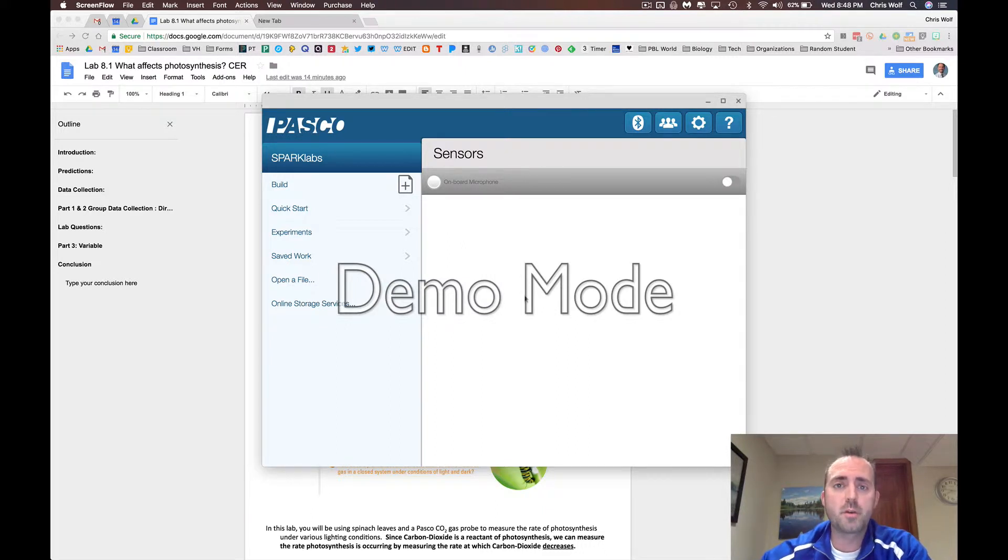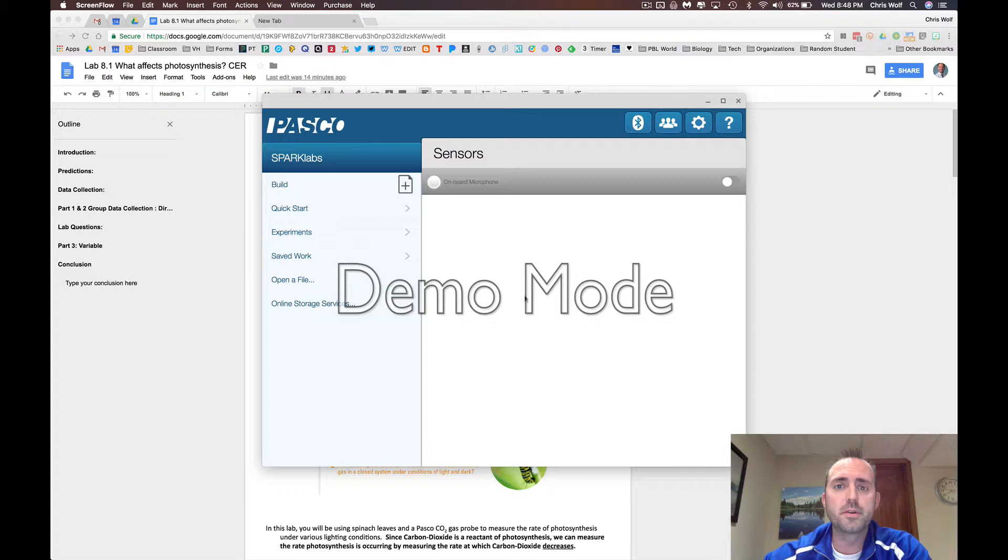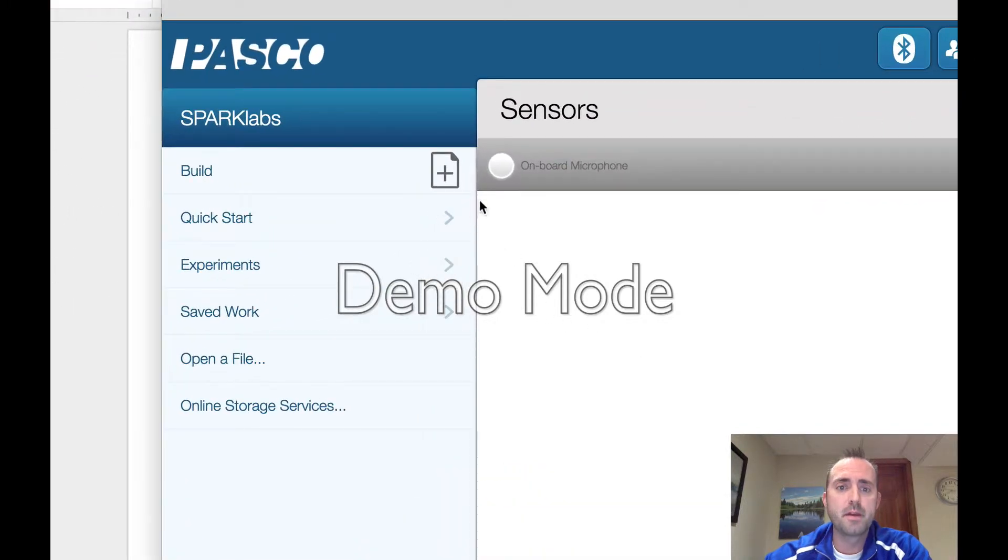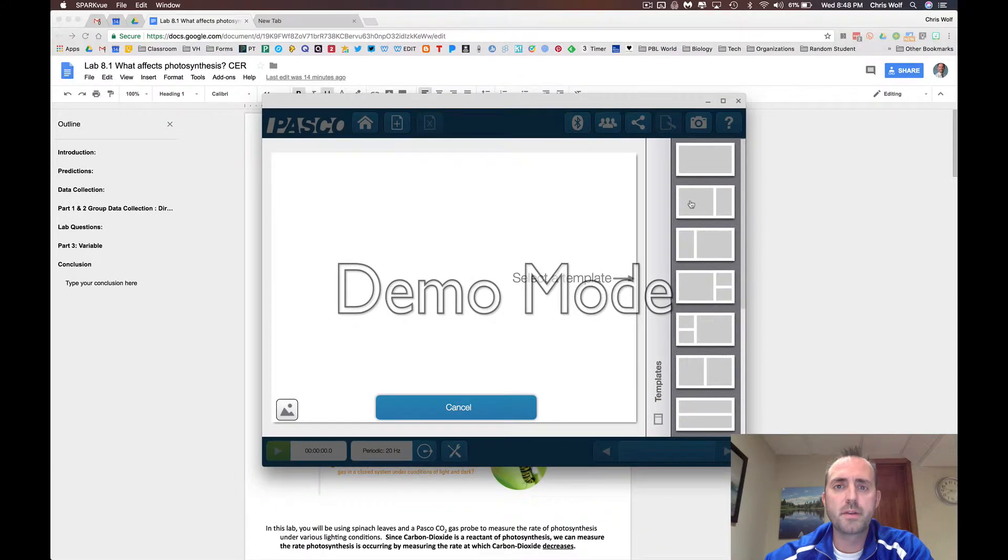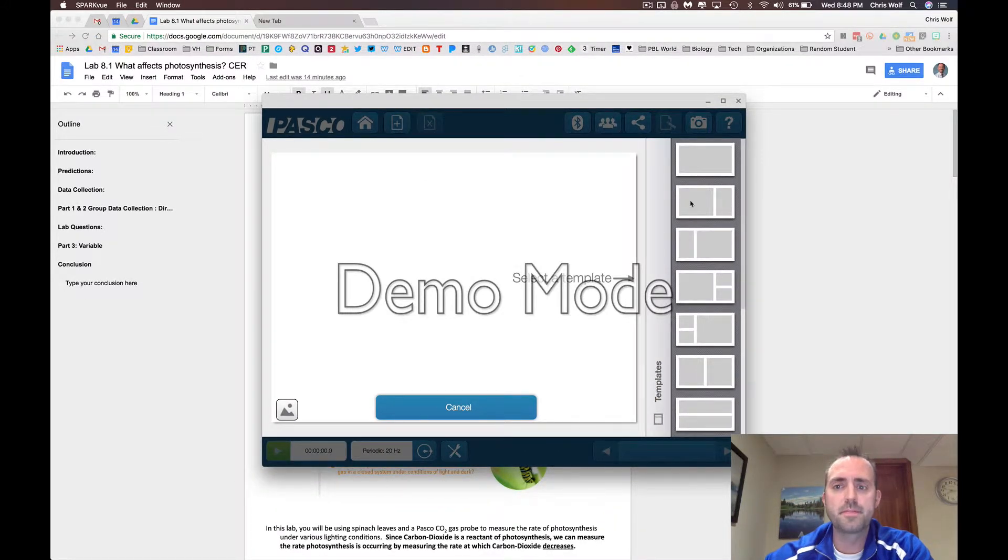Once you've installed the Chromebook app, you need to go to the build part to build your data collection page for this lab. By clicking on this plus icon here, you'll be able to build your page. I always recommend using the two-field template to record data for this photosynthesis lab.